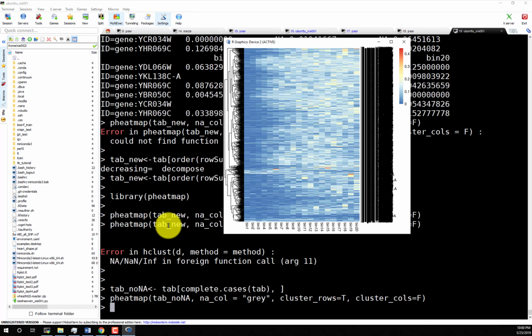But one thing we need to emphasize again is the NA. If you use ChIP-seq data, there's no such issue, because the ChIP-seq signal depends on the read density. But whole genome bisulfite sequencing relies on the methylation information in the read. If no read covers that position, we won't be able to get the methylation information.